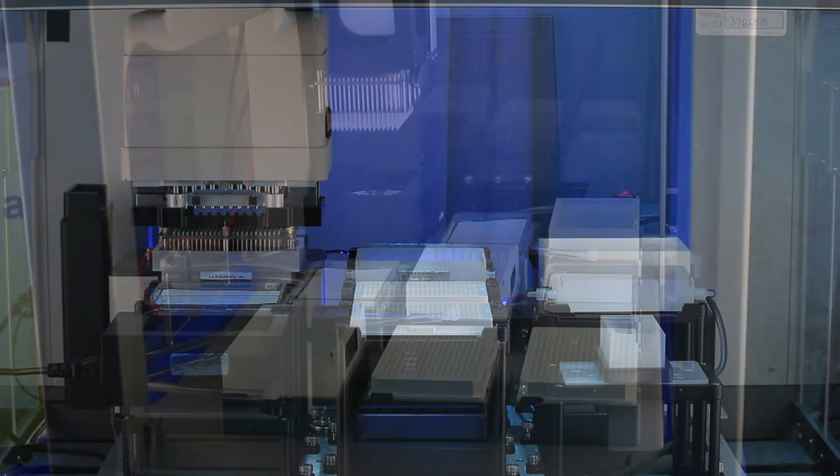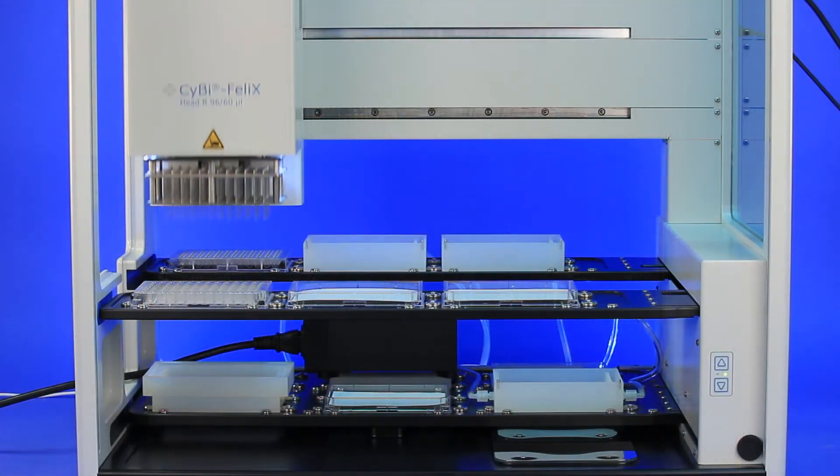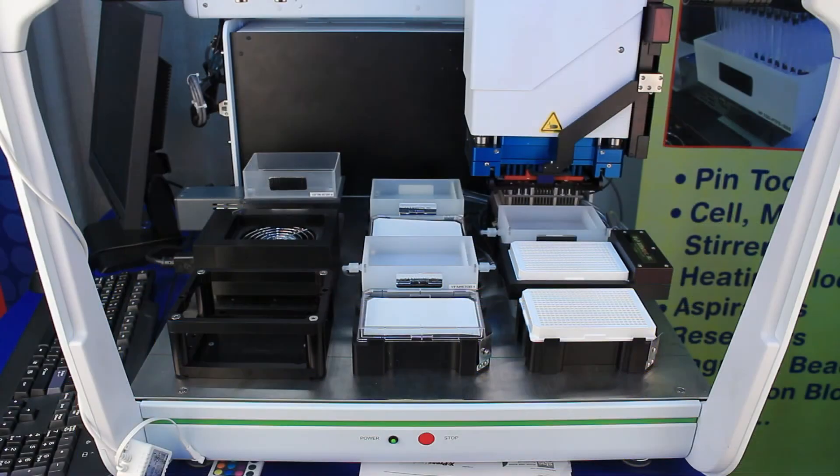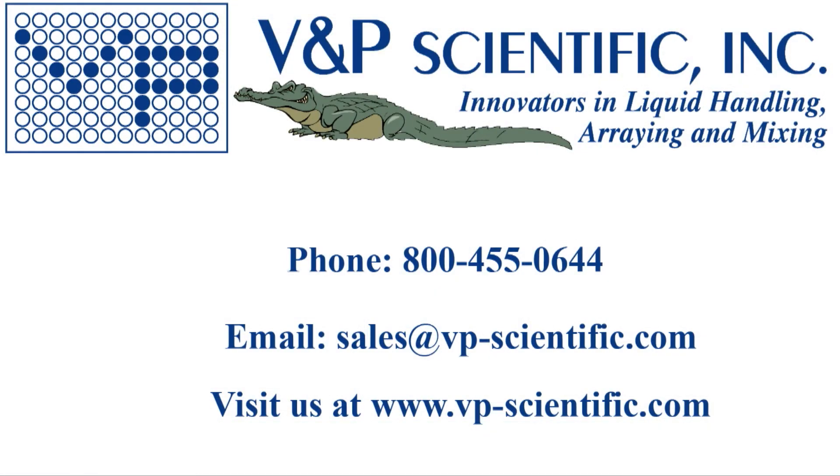With VMP's pin tools, you can increase your throughput. Integrating a pin tool with your liquid handler will expand your capabilities. Contact us for more information on the products you have seen in this video. Thank you.